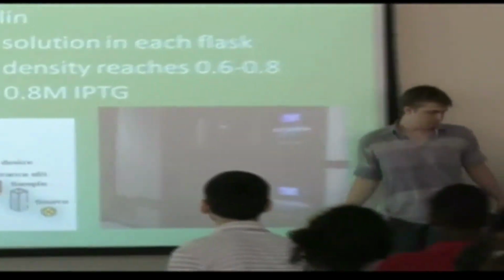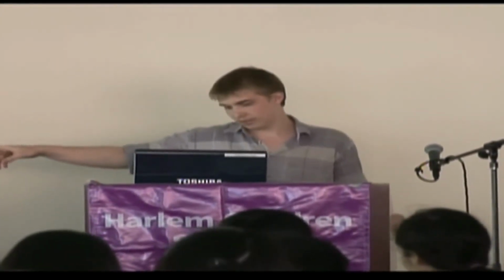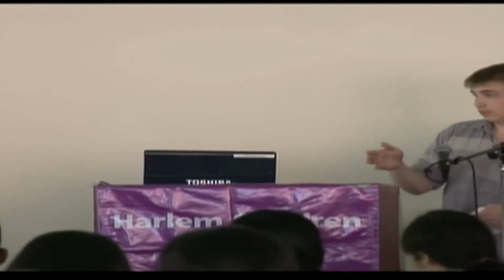Now, you put your sample in the prism over there, on the rectangular prism, and the light shines right through the rectangular prism. And the way that the light is reflected or received on the other side, that's the way cell density is determined.